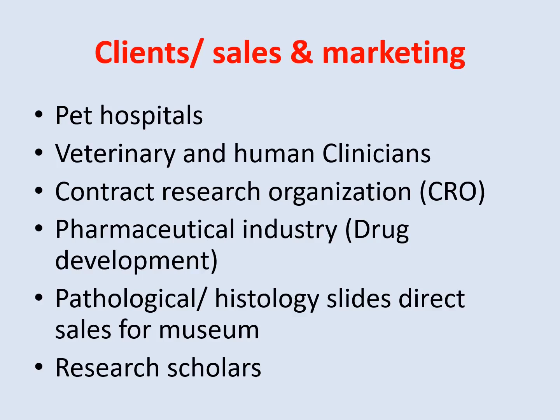So all this study is performed in case of drug development. So the pathologists want histopathology for this drug development.